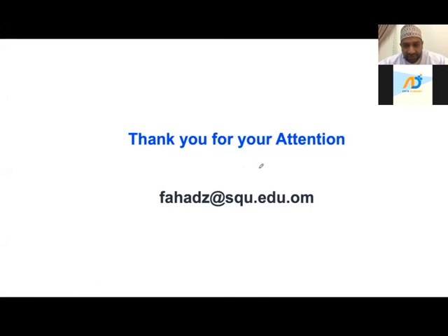Do we need to use SPSS to do the statistics? Somebody actually asked me, do you need to use SPSS? Actually, SPSS is a statistical tool. Real-time PCR is a method that gives you numbers, data. How are you going to analyze those data? You can use SPSS, and if you don't have SPSS, Excel is more than enough. Excel can do all your analysis because most of the time in real-time PCR, we usually use Student's t-test or ANOVA. Maybe you can use the Mann-Whitney U-test if you have non-normalized data, but usually in real-time PCR, if you're using a very controlled experiment, Excel is more than enough.